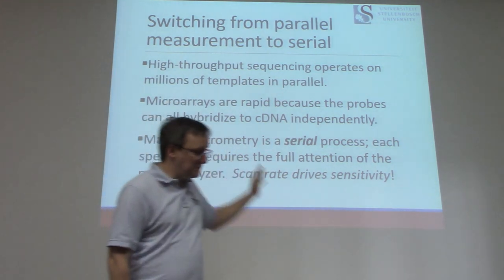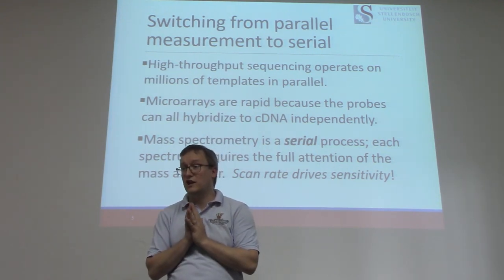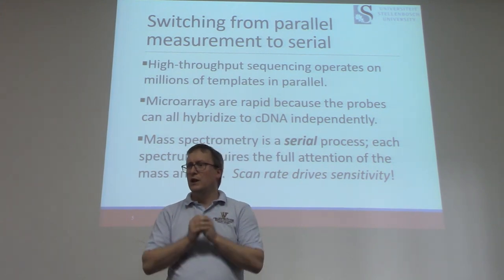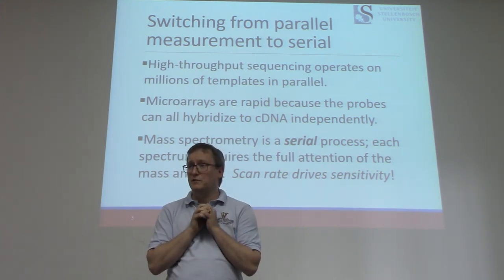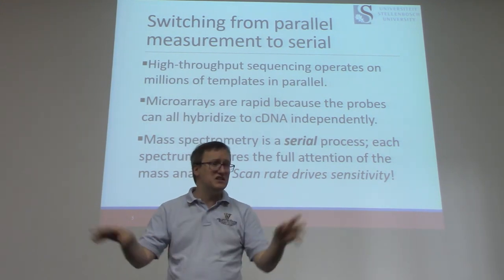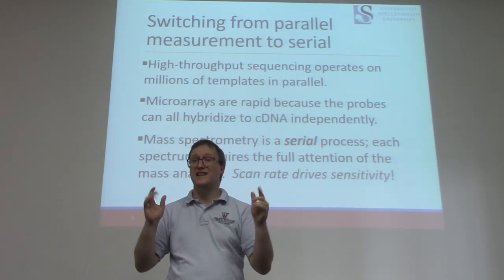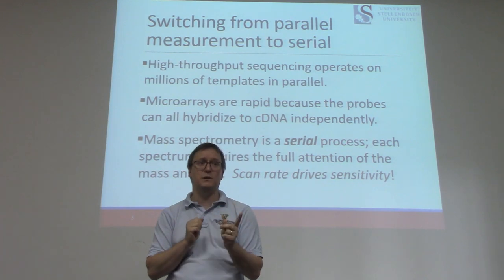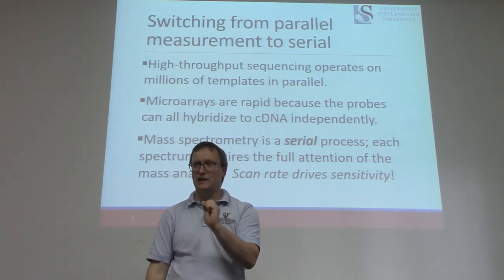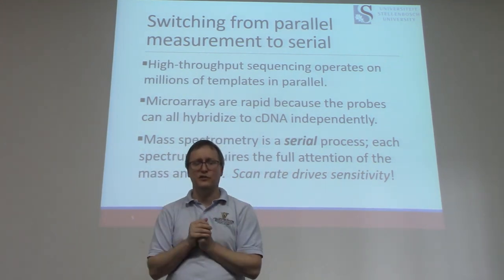So in a lot of respects, we have changed from a parallel process in genetic sequencing to a serial process. Parallel versus serial. By that, you remember my favorite term for modern-day sequencers is massively parallel sequencing, because millions and millions of templates are all getting sequences inferred at the same time. That's quite different from proteomics, because generally speaking, in proteomics, the instrument at any given point in time is analyzing one peptide, most typically, and under shotgun workflows that are so very common.